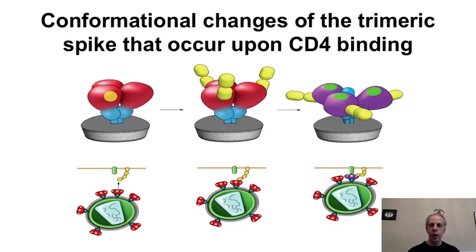And then the interaction starts, and then they ask you more image processing questions, and then you try to address that. And that's what we illustrate here with a schematic, that there is a change in shape, a change in conformation when there is CD4 binding. And that's what we illustrate here with this change in the arms, kind of an opening. And you can see this with image processing. You couldn't see that with your naked eye. This is one of the really exciting areas where image processing actually helps you see something you couldn't see before.